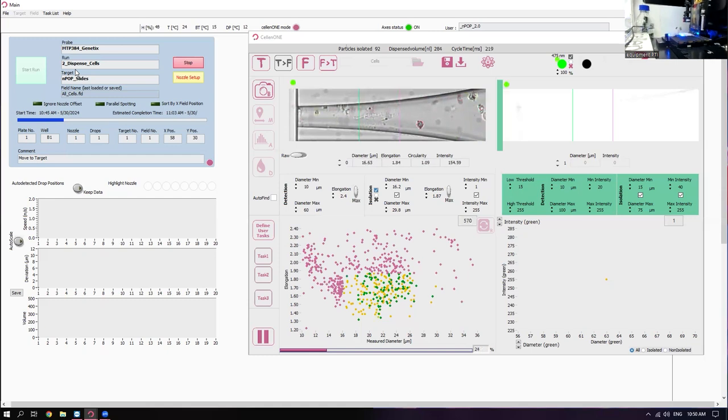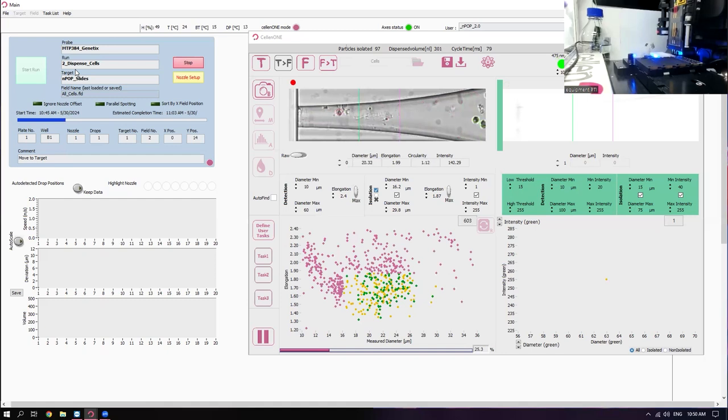And because the DMSO is so hygroscopic and it freezes at like 18 degrees, right? Of course, if you ever look at DMSO-water freezing charts, yep. Like if you look at what the freezing point of DMSO is, it's like 18 degrees. Freezing point of water is 0 degrees, right? The mixture of them goes down to like negative infinity though, right? 0 Kelvin or something. It's a pretty crazy chart when you mix DMSO and water. It's a very interesting kind of interaction.